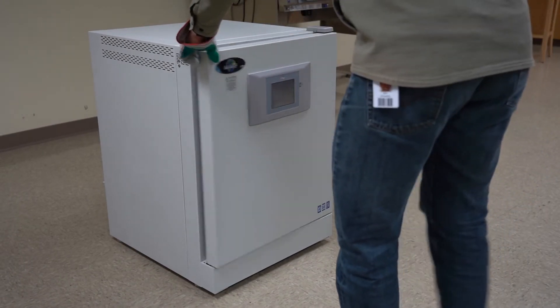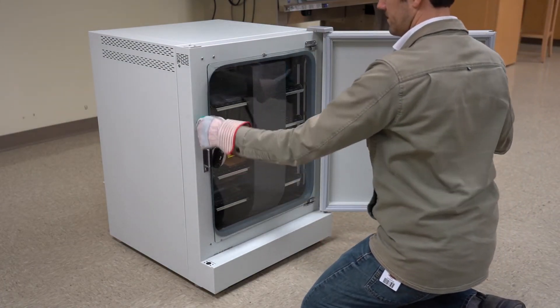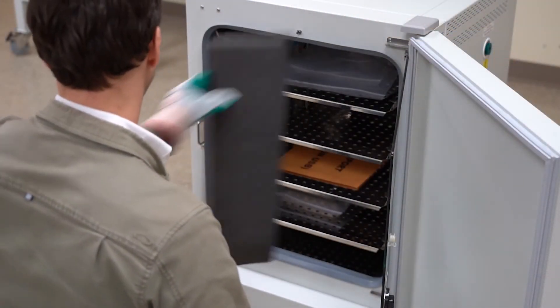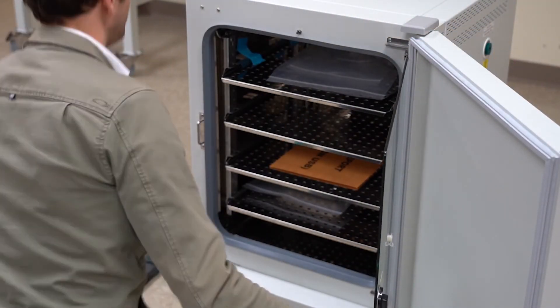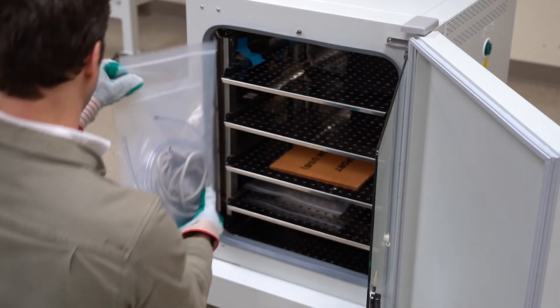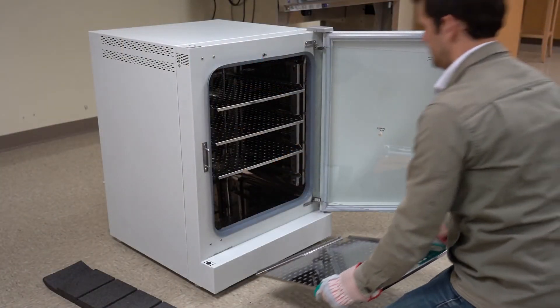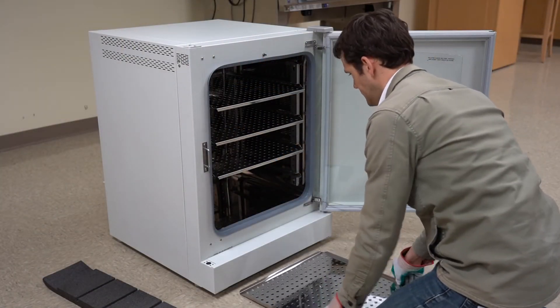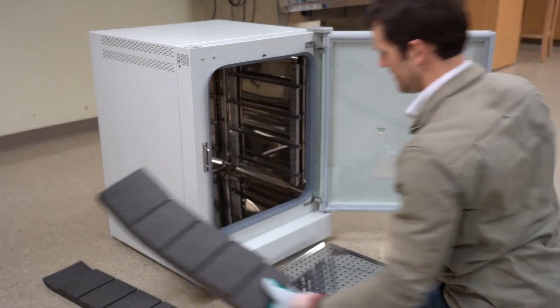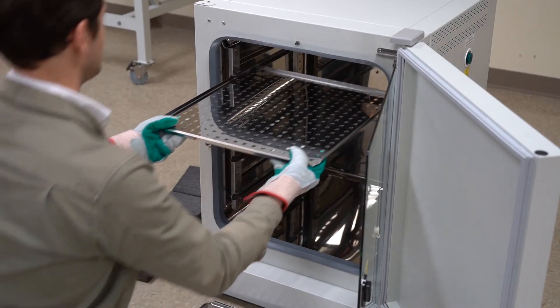Open the doors to remove the foam in front of and behind the shelves, as well as the blue packing tape. Set aside the plastic bag of parts found in the incubator for future use. Put the shelves back into the chamber.